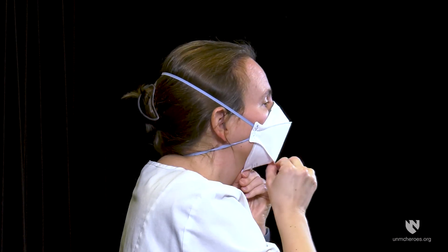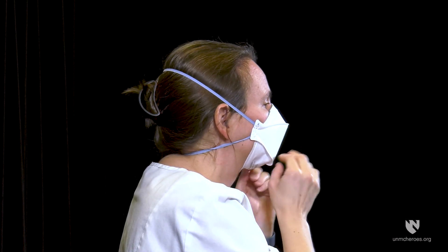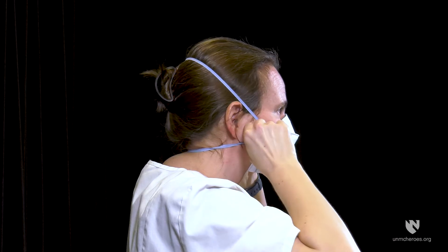Adjust for a comfortable fit. Pull the top panel toward the bridge of the nose and the bottom panel under your chin. Remove any twists in the straps.